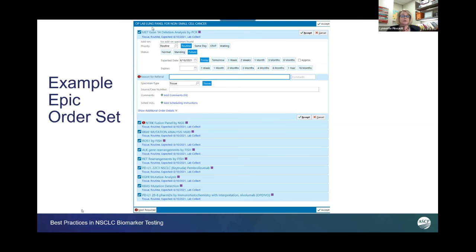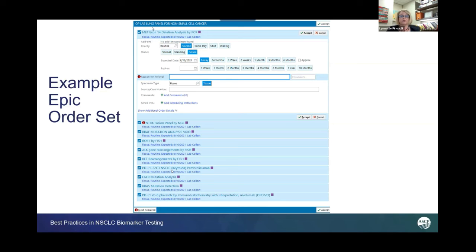It also gives us opportunity for PL1, for example, to say if we perform that in-house, we can just change this order to route in-house versus to a reference lab queue.